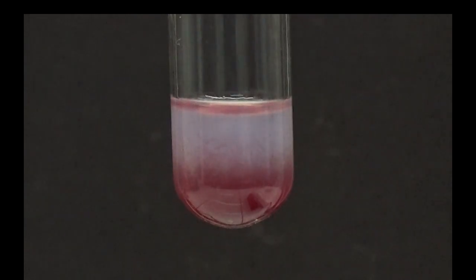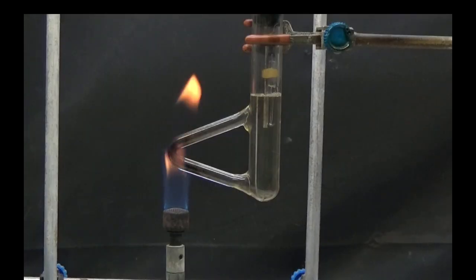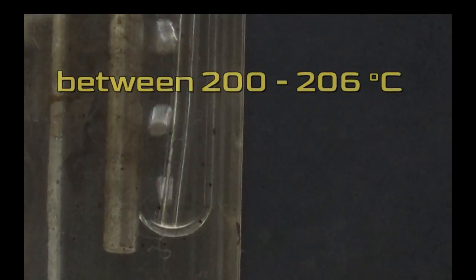To prepare the Brady and nitroprusside reagent, I leave you the link from my video on tests for ketones and aldehydes. The final test is the boiling point, which in our test yielded a result between 200 and 206 degrees.